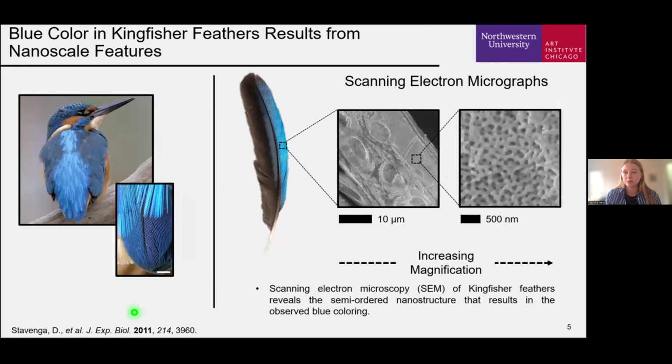To address this and better understand the mechanism of kingfisher coloring, we first aim to identify the mesostructures responsible for the coloration using purchased reference feather samples, as sampling was not possible. On the left is the image of the common kingfisher, historically the most frequently used species in the craft. On the right are scanning electron micrographs of a reference kingfisher feather. Through the SEM analysis, we were able to discover the structure responsible for the bright blue coloring is a sort of semi-ordered array with this almost nano-sponge-like appearance.